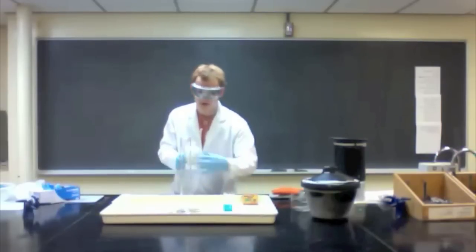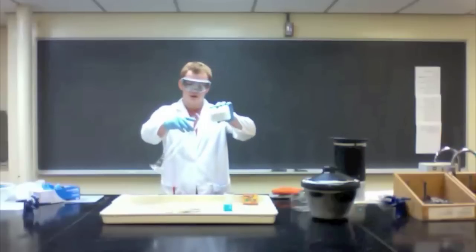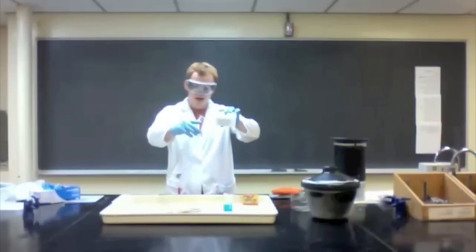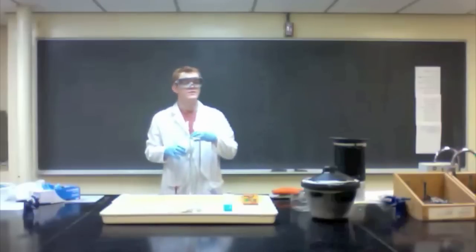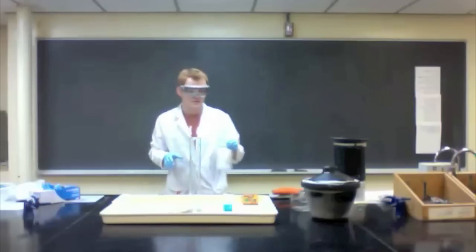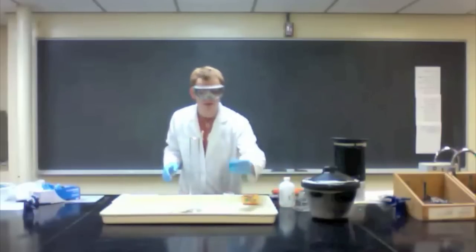What I'm going to do, however, is add it to this graduated cylinder and I'm going to add a catalyst for its decomposition. And you'll see it get very hot and something else really cool too. I'm also going to add some detergent.